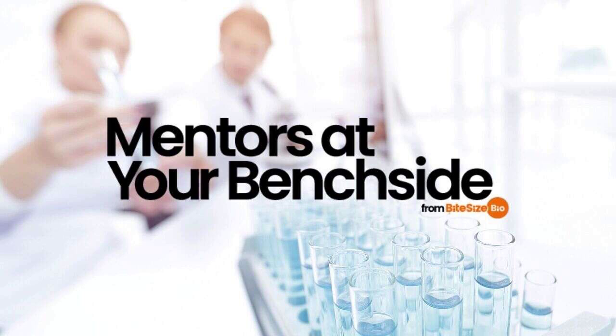Use a solid, non-magnetic and non-porous container or a test weight and weigh it repeatedly after returning to 0 at the end of every weighing cycle. Watch out for numerical readings turning blank or becoming frozen. This indicates your equipment may have become contaminated, damaged or mishandled, and is thus not producing the desired results.